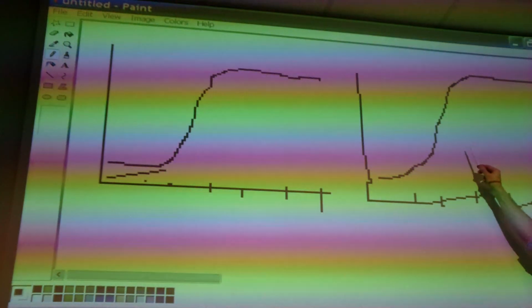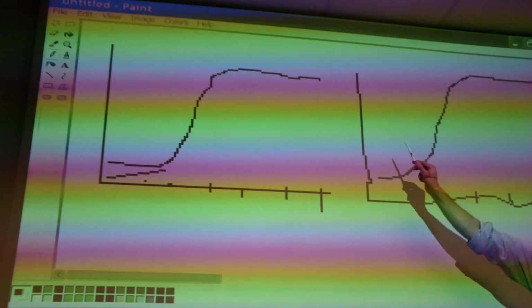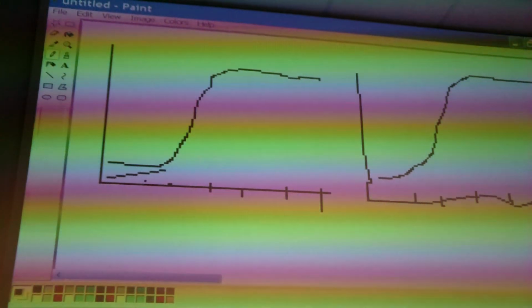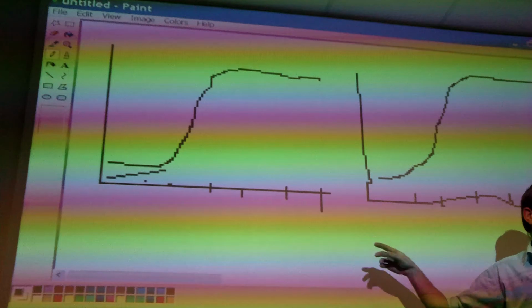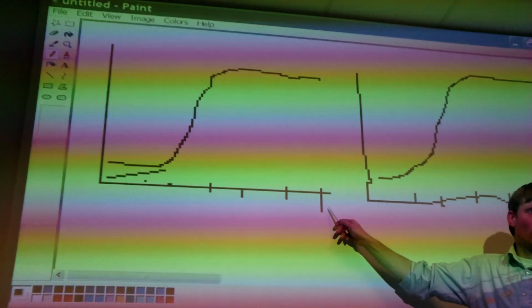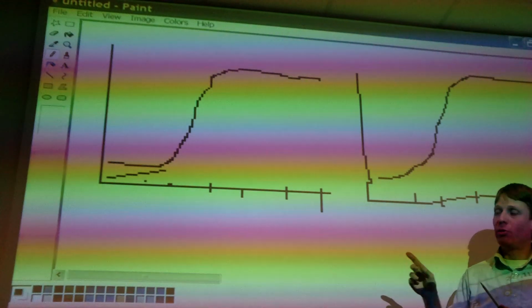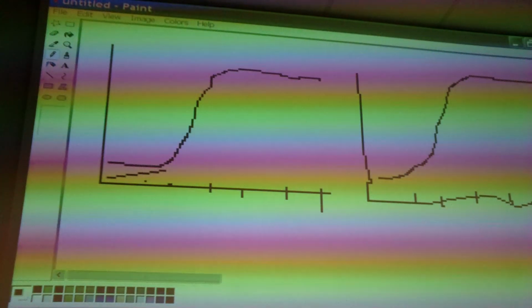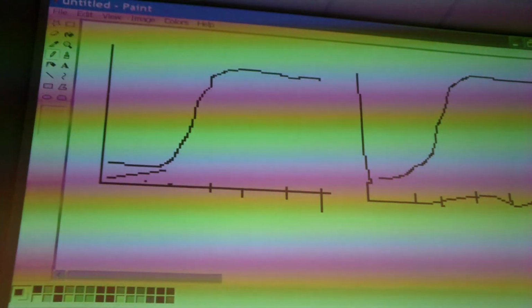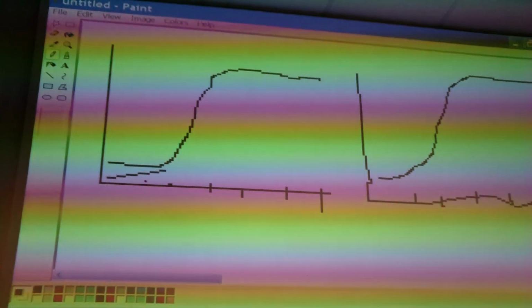So then you can superimpose this curve on that one. And assuming that you have here 1 gram per liter and here 1 gram per liter of sample, they should match completely, right? If your standard is undiluted, say 1 gram per liter, and your sample happened to be exactly the same, then these two curves should be identical, right?